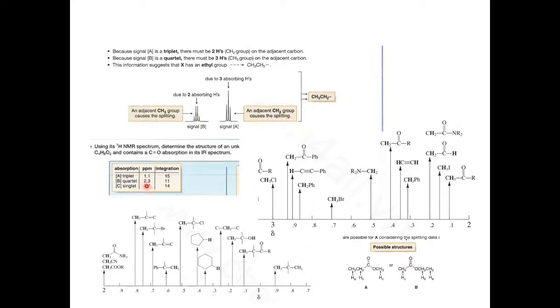Now the one has 2.3. 2.3 is what kind of here? This is a, like this type of, plus see this one 2.4, 2.3, CH3CO, right? CH2CO. So this proton has attached to CO, plus we have the data of CO absorption band.